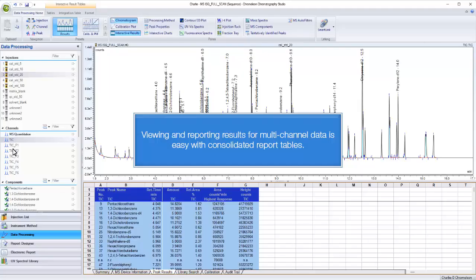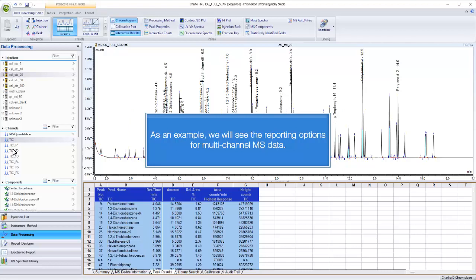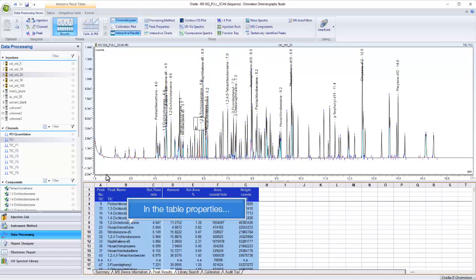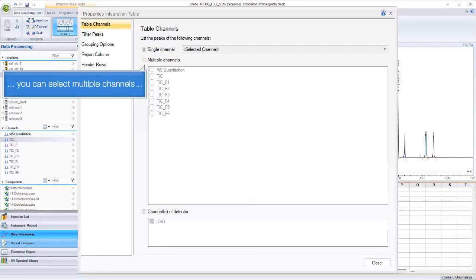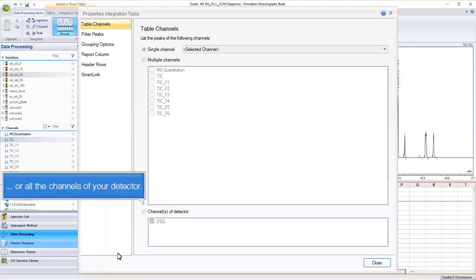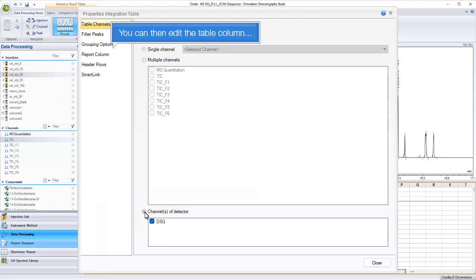Viewing and reporting results for multi-channel data is easy with consolidated report tables. As an example, we will see the reporting options for multi-channel MS data. In the table properties, you can select multiple channels or all the channels of your detector.